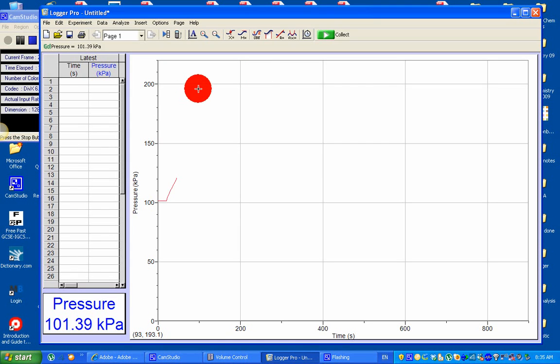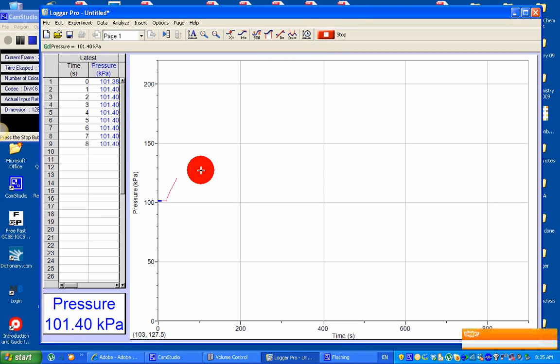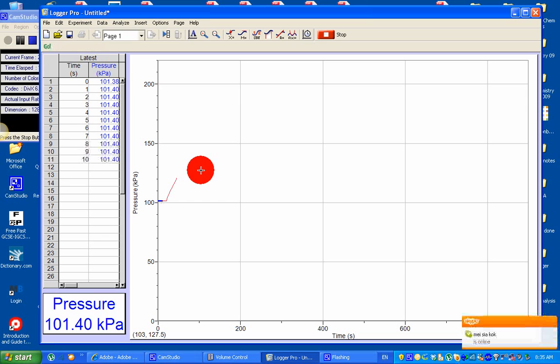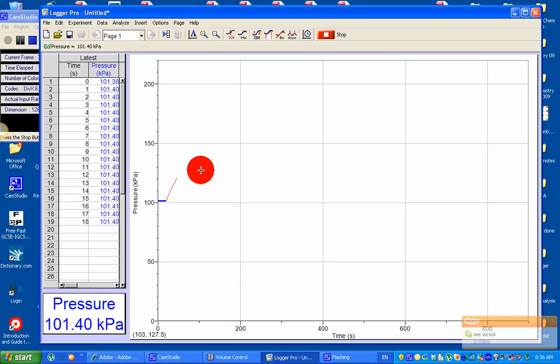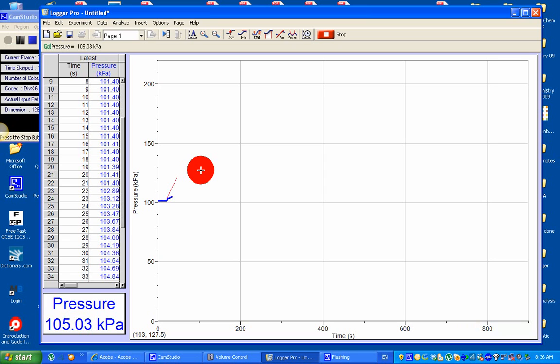Click on data collection first. Before I add the magnesium, pressure is 101. I'm going to use a lower concentration, which is 0.25M hydrochloric acid — same procedure. I'm going to add it and then measure the pressure increase. This is done at lower concentration, 0.25M hydrochloric acid. There's a pressure increase, and it's represented by the blue line.